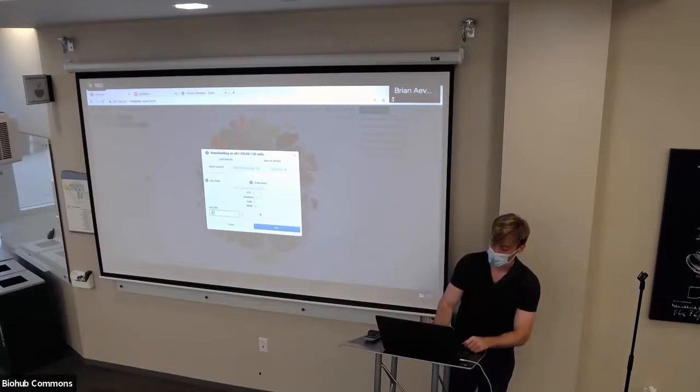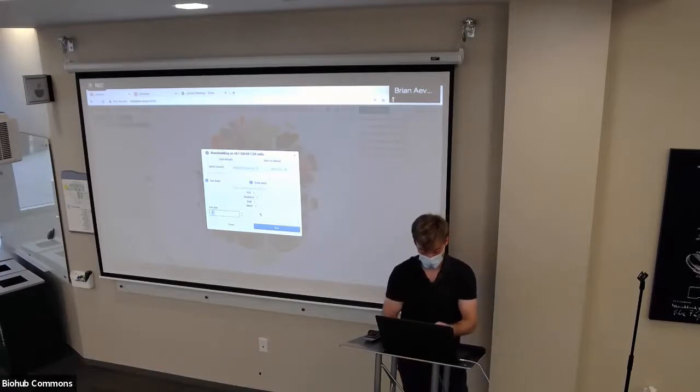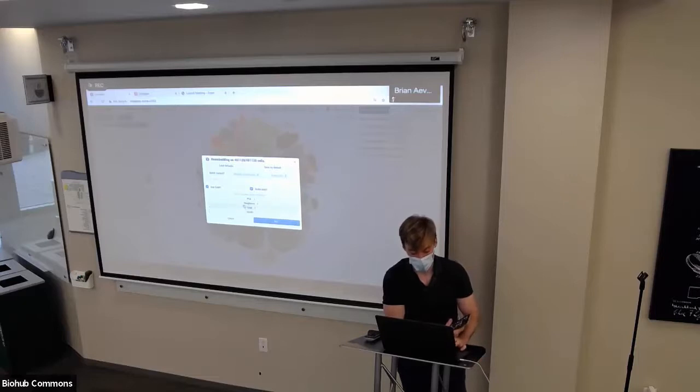Yeah. And one more thing. Would it be easy to add, for example, something like diffusion maps if people wanted to do trajectory analysis using a different embedding? Yeah, super easy. I would just change this to projection and have sub menus for whatever method you wanted. Yeah, I think that'll be very useful.